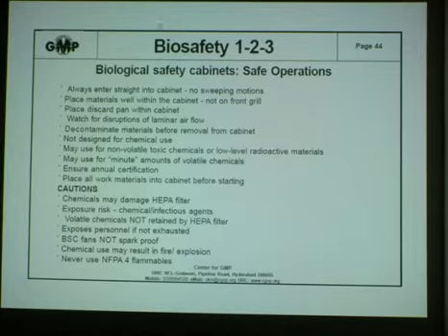It is not designed for chemical use. Do not use it for volatile toxic chemicals. You may, however, use it for non-volatile toxic chemicals or low-level radioactive materials. May use for minute amounts of volatile chemicals. Ensure annual certification. Place all work materials inside the cabinet before starting.